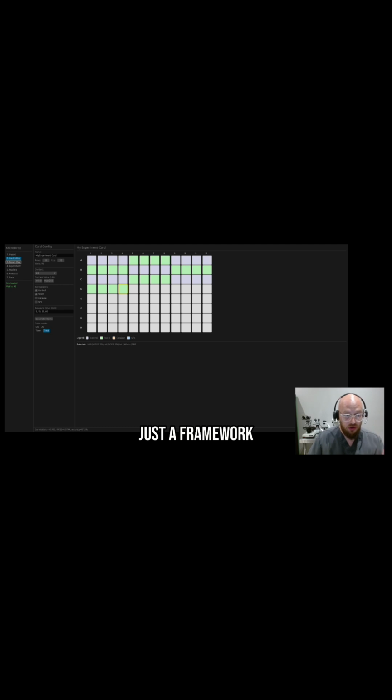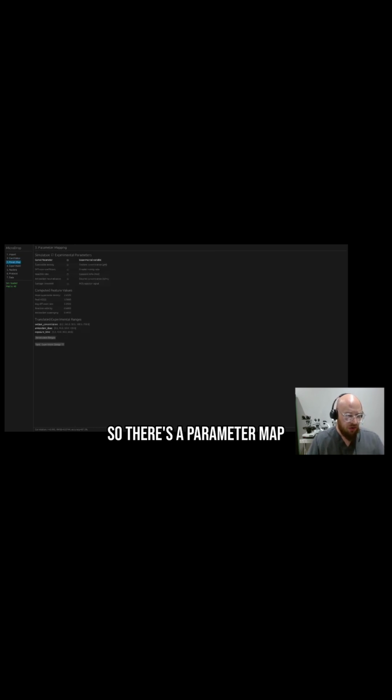This is definitely just a framework, because as I learn more and make it through the weeks of the cloud automation, hopefully this will become very clear and very easy to use. Okay, there's a parameter map where you can translate the ranges. You can have the diffusion coefficient, the droplet mixing ratio. That's like trying to test your specimen. In my case, I would like to test the overexpression of a mesenchymal stem cell or stromal cell. That's what I do, and I have published a paper in Aerospace Research Central that outlines the grand aim of the project, which is also in the 3 aims that I have to do. Okay, again, this is for How to Grow Almost Anything 26, and it is really basic.